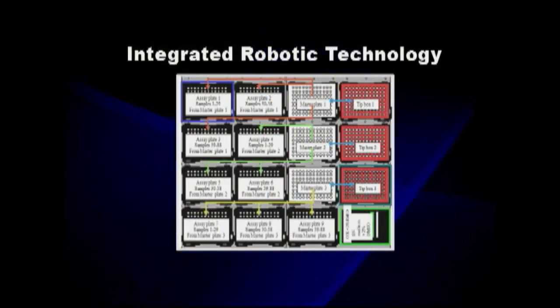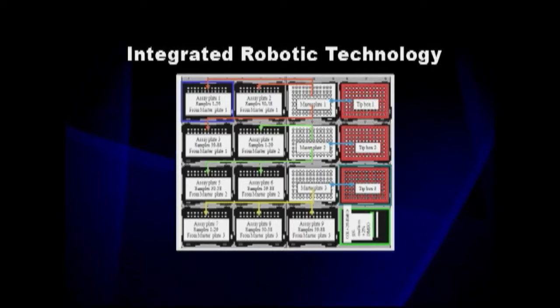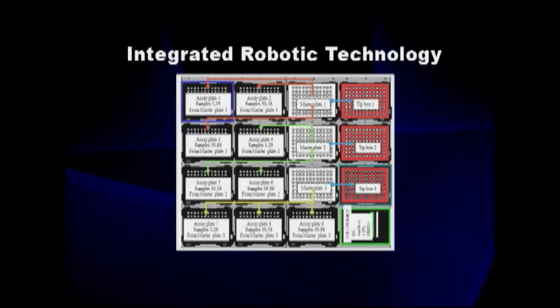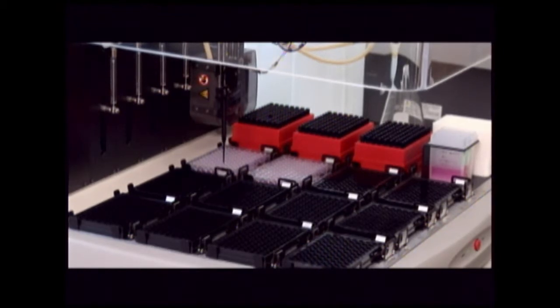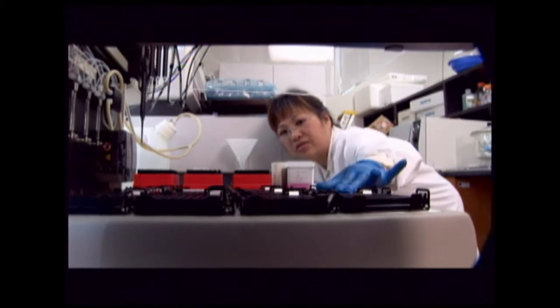After the assay is developed and validated, we use integrated robotics technology to screen the library in high throughput mode. We design the plate and run the samples in triplicate, and we can carry out screening of thousands of samples every day and complete the screening in several months.